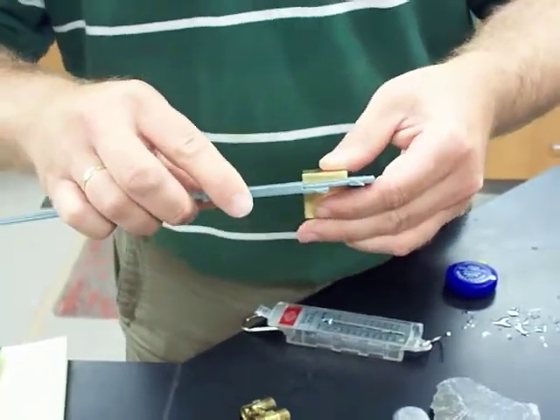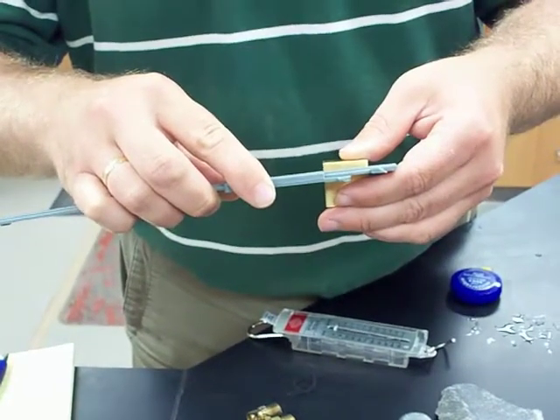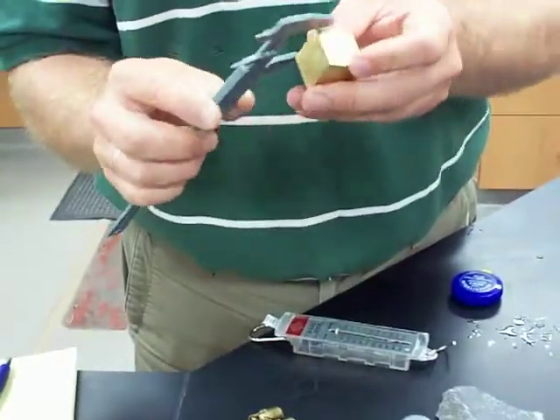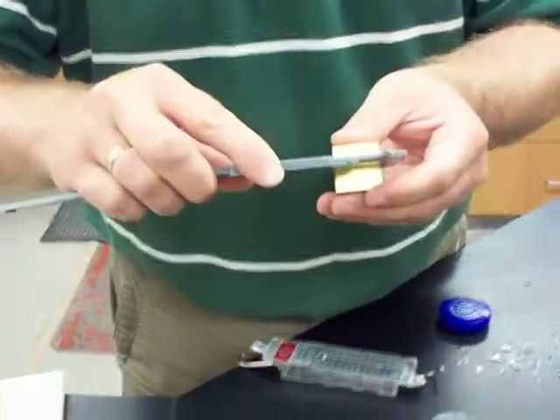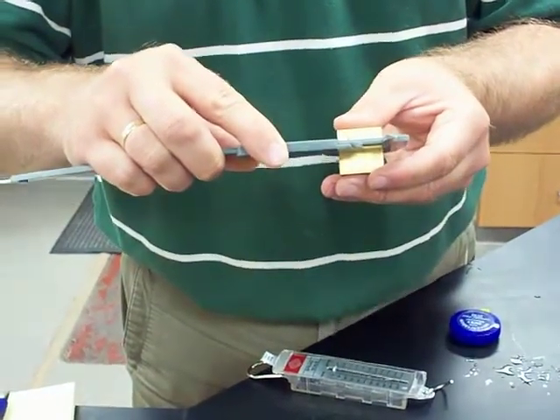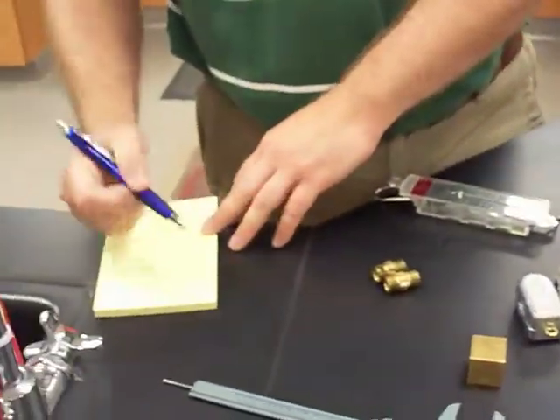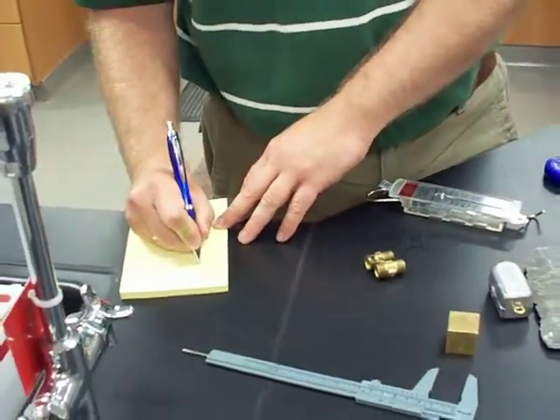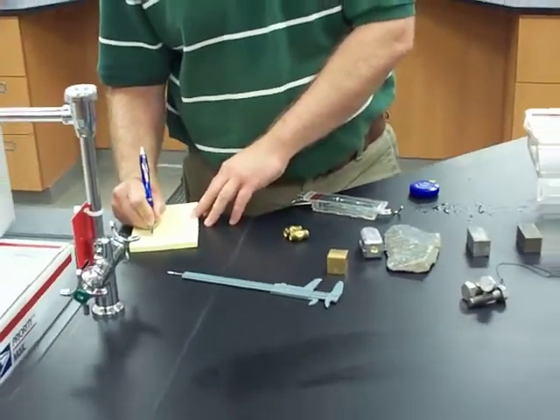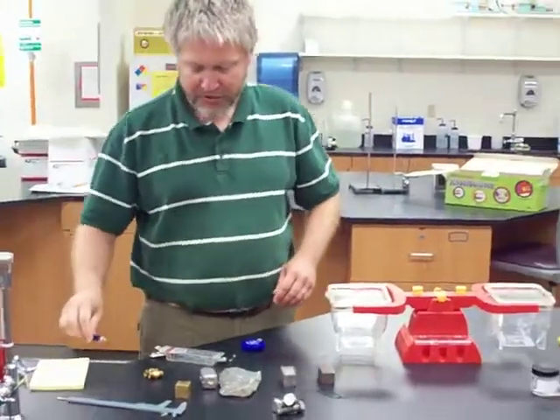And since it's a cube, this one here is also 2.53 centimeters, and then I need the height, and again, since it's a cube, 2.53 centimeters all the way through, with an error of 0.005 centimeters because I cannot measure any more accurately.